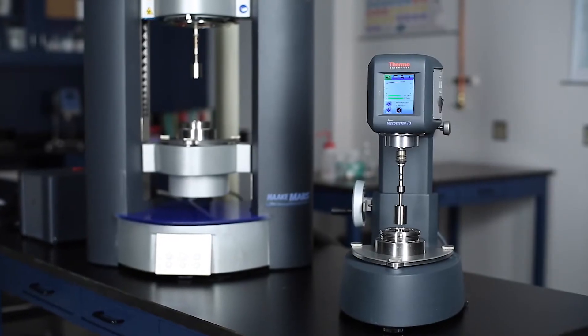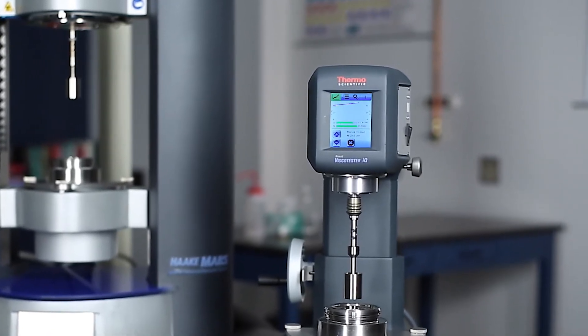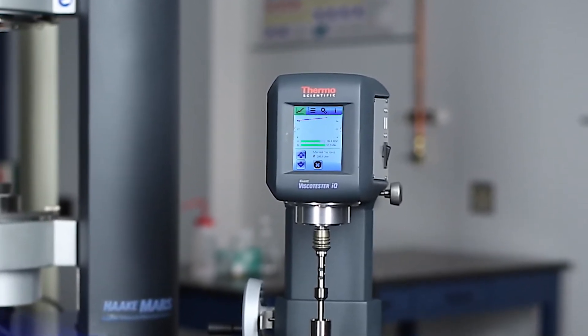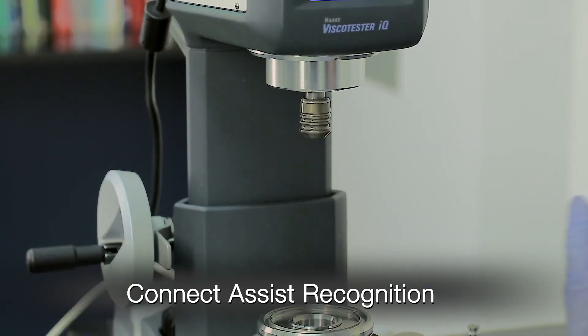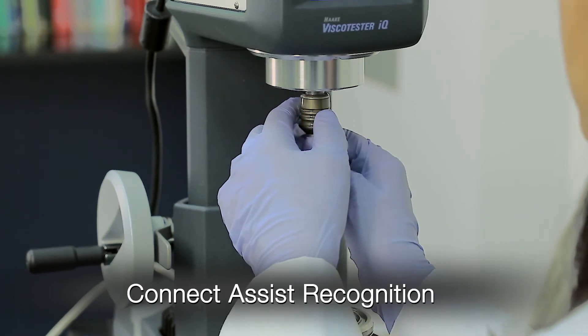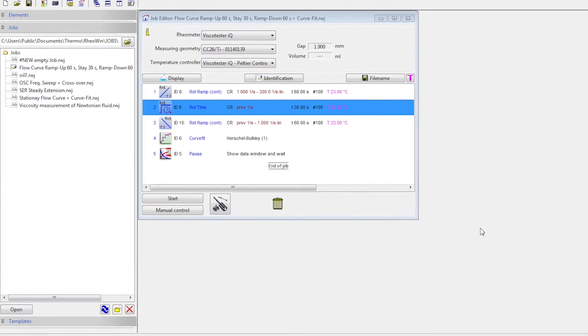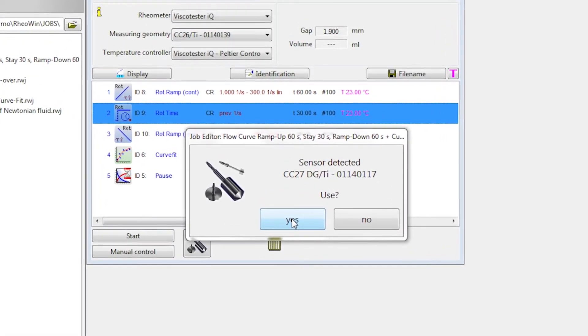The Haake ViscotesterIQ Rheometer gives you maximum flexibility to design solutions meeting the individual requirements of your quality control laboratory. The exclusive Connect Assist provides new quick coupling capabilities for measuring geometries and temperature modules and guarantees perfect alignment, automatic recognition and integrated feedback for job optimization.